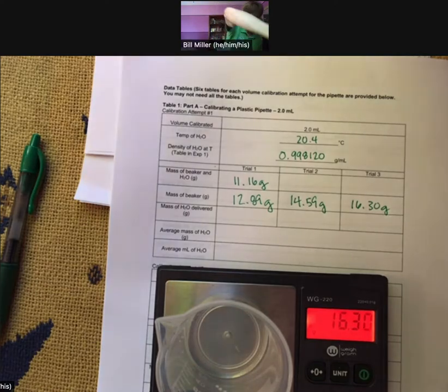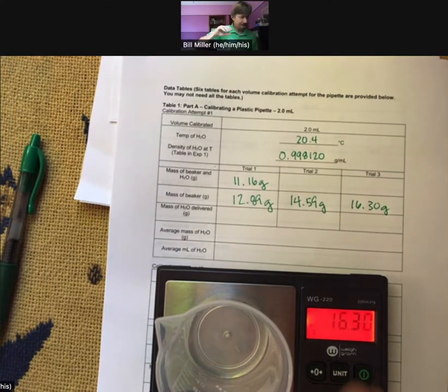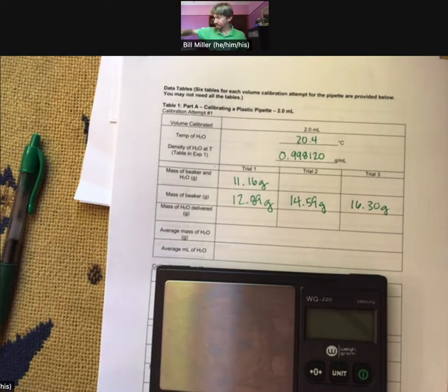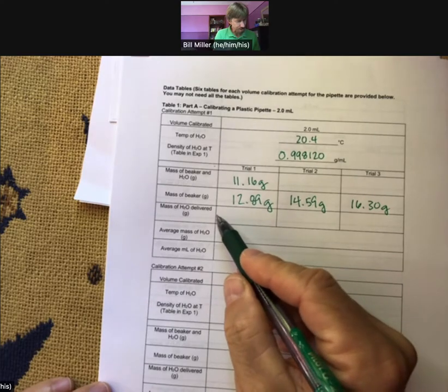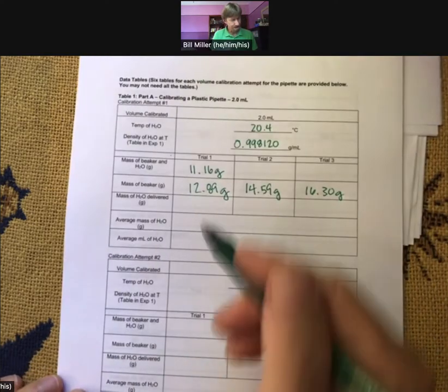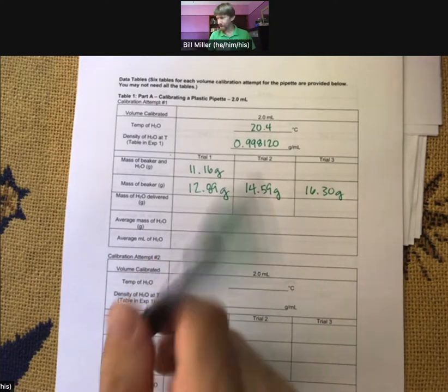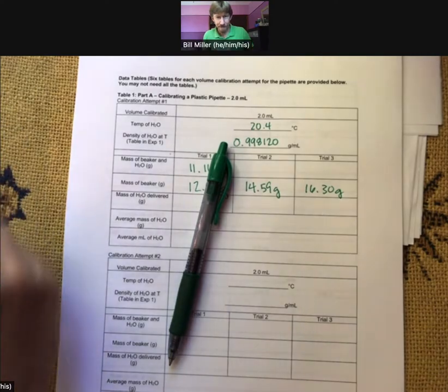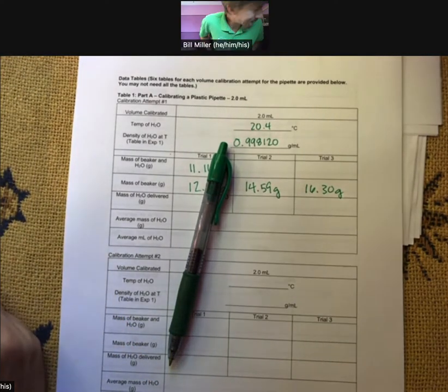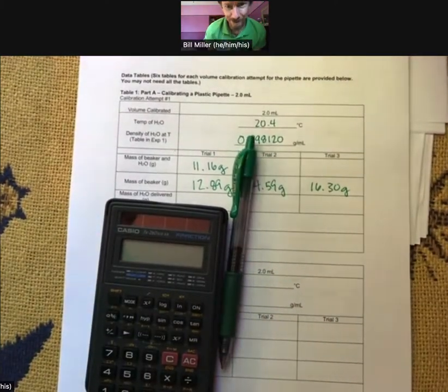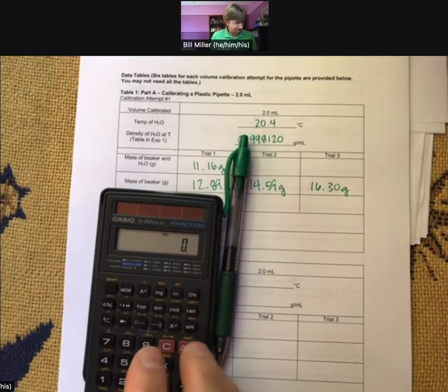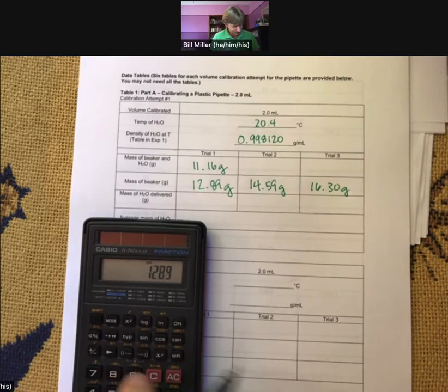I've done step eight in the procedure. Empty the beaker into the waste, turn off my scale. Now let's figure out the mass of H₂O delivered. That's going to be 12.89 minus 11.16. I'll get my calculator — 12.89 minus 11.16 equals 1.73.